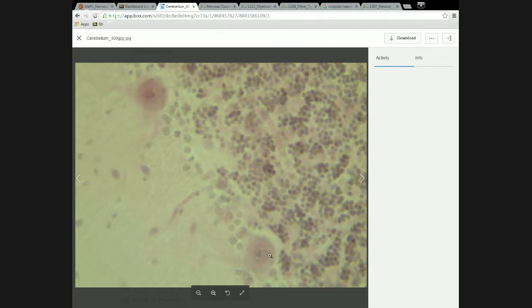The nucleus is definitely more obvious, and the cytoplasm is a bit more distinct. On the projected version of this, you might not be able to see it so clearly, but if you look directly on the computer screen, you should see a pretty good representation of the base of a dendrite right here, and a suggestion of a dendrite coming out here maybe, or over here maybe.